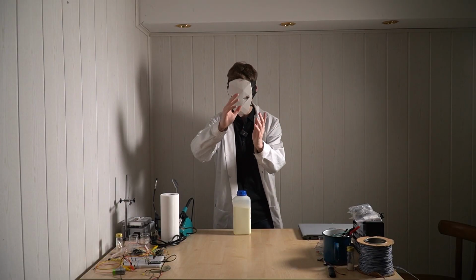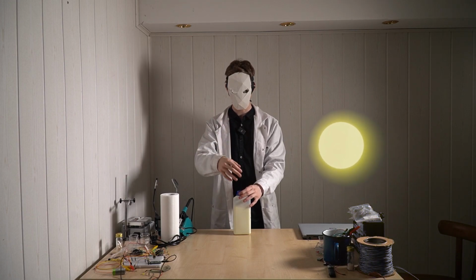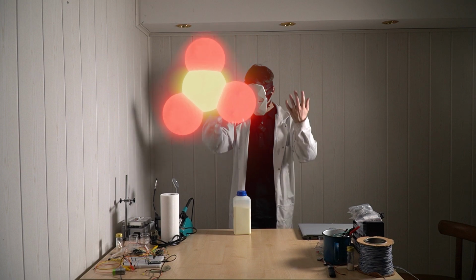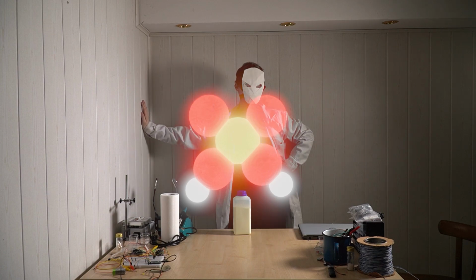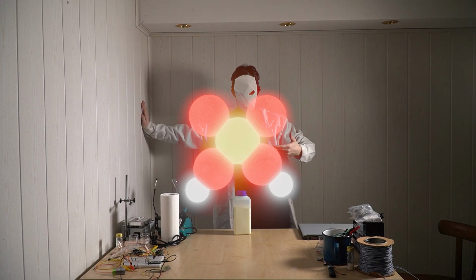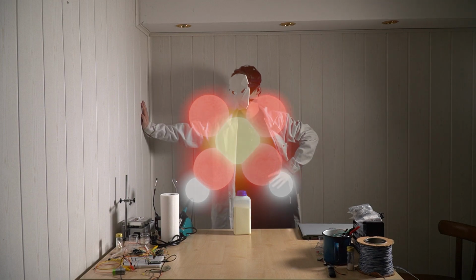So I thought maybe we could take this sulfur, burn it to make sulfur dioxide, then oxidize to create sulfur trioxide, then take the sulfur trioxide, dissolve it in water, and boom, sulfuric acid, magic. Now yes, there are certain complications that come with this process, like for example, there's a lot of heat when you dissolve sulfur trioxide in water, so that's kind of a problem, but these are all minor hiccups.